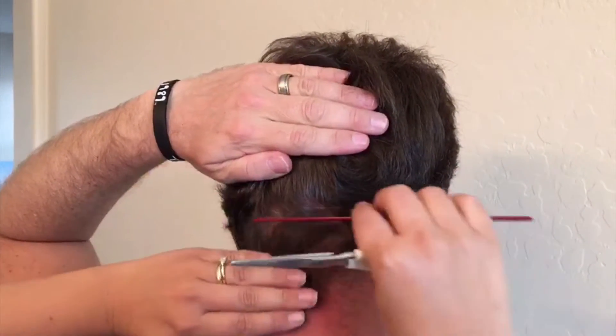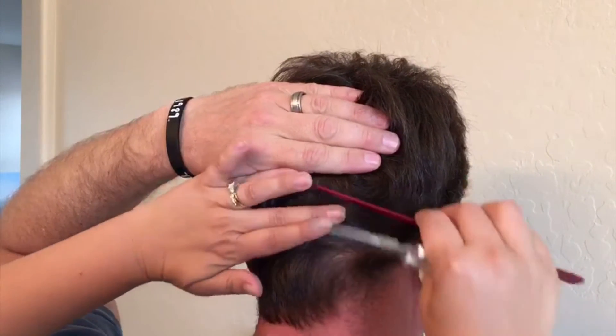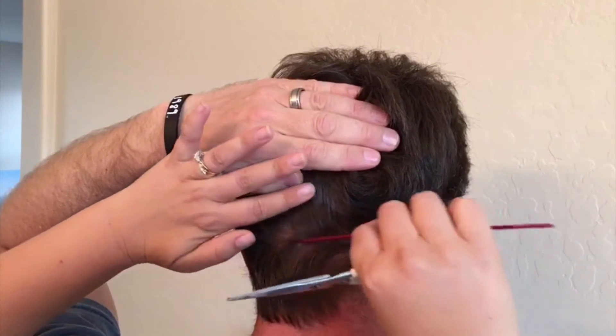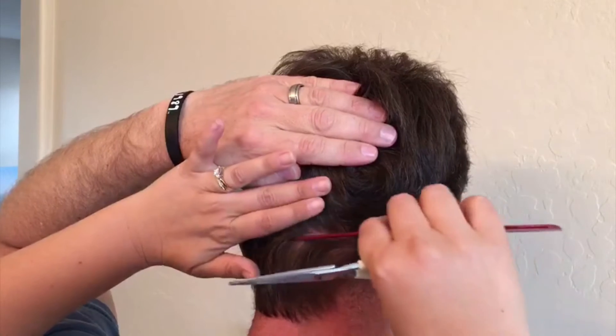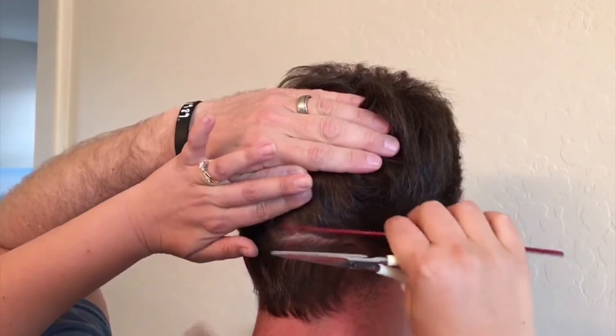I'm going to even this out a bit. When we have this sectioned up, it can be a little bit tricky. If someone had a barber clip, that might help as well.